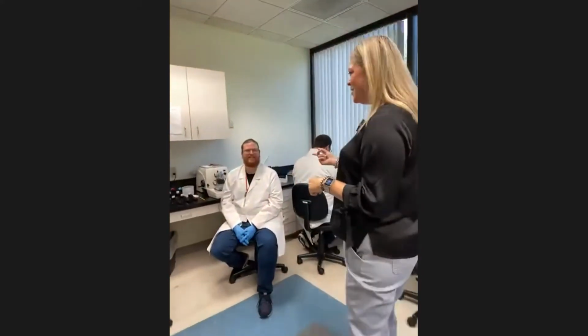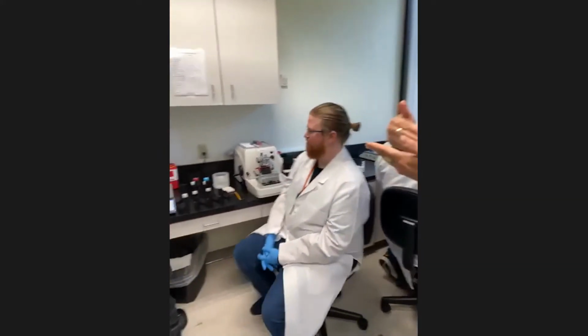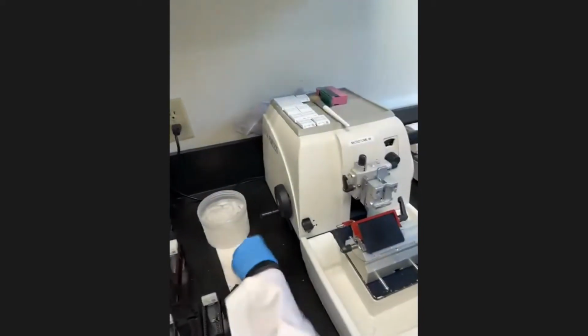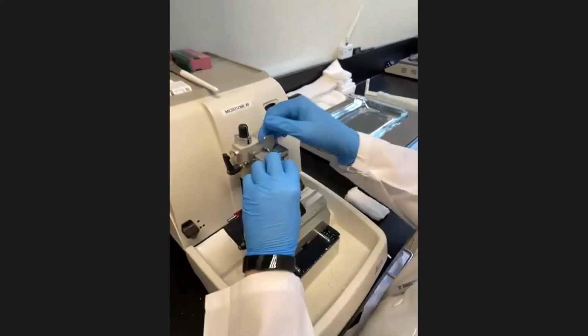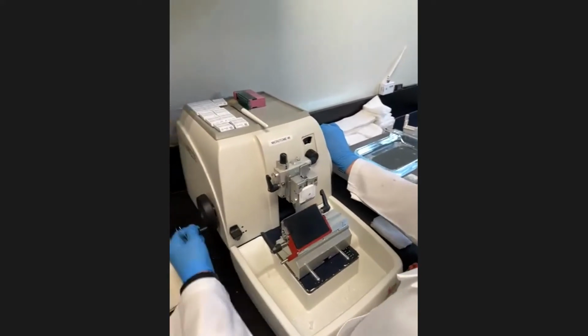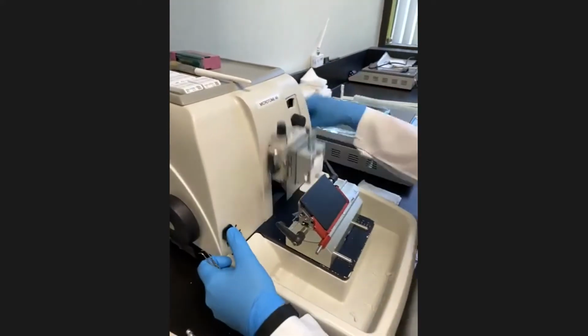This is Brandon. Brandon, do you mind showing us a quick slice through what cutting looks like? Yeah. So we want our blocks ice cold, ready to roll. So this is what our kidney tissue looks like in the block. I'm going to mount it on our microtome. We're going to roll off some ribbons. A little bit of focus here.